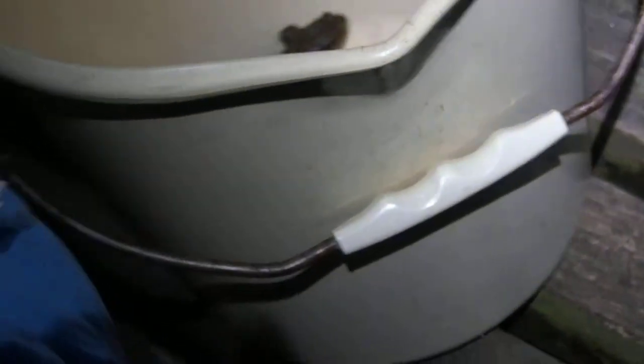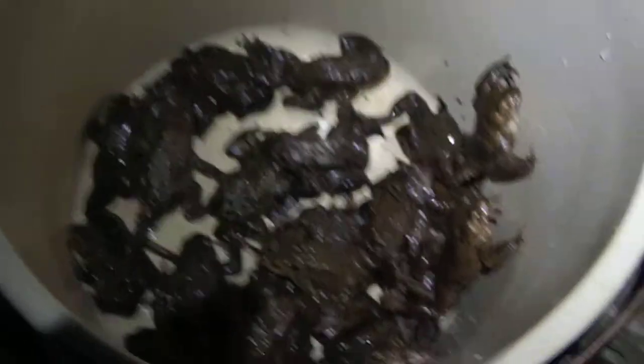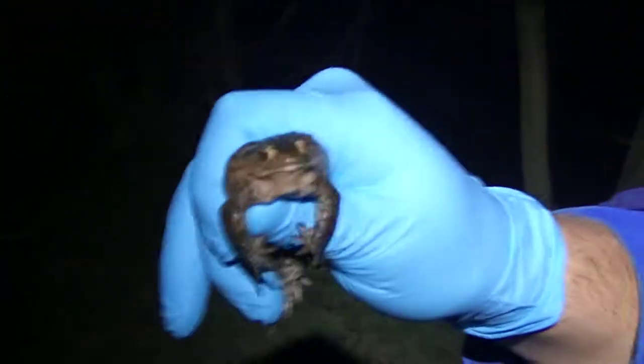And then to make sure that we're not sampling the same toad again, we have all of our sampled toads in a bucket and we release this one back into the pond to make sure that we're not sampling it again.